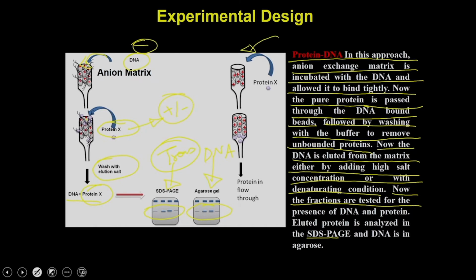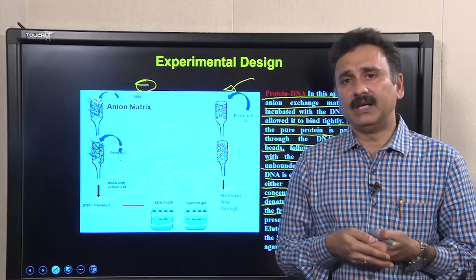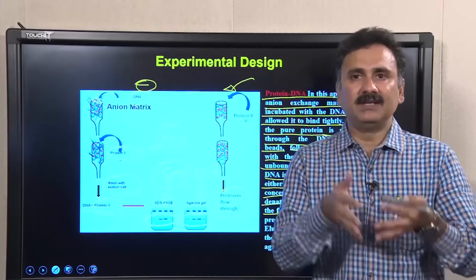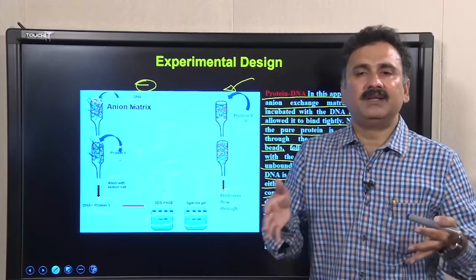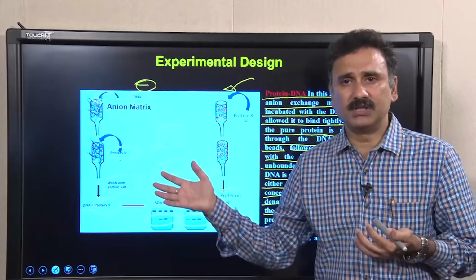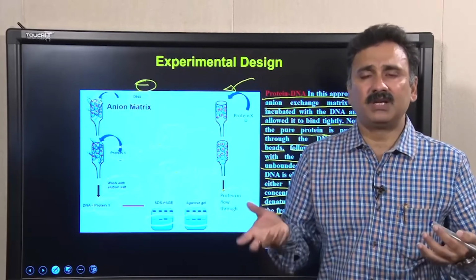So, whatever will bind to the beads and come through into the elution profile, those are proteins you can easily ignore, because it is not only the transcription factor that binds; other proteins will also bind to the DNA. For example, single-stranded DNA binding proteins, helicases or DNA polymerase are proteins that also have a very high affinity for your promoters or probably a small stretch of DNA.